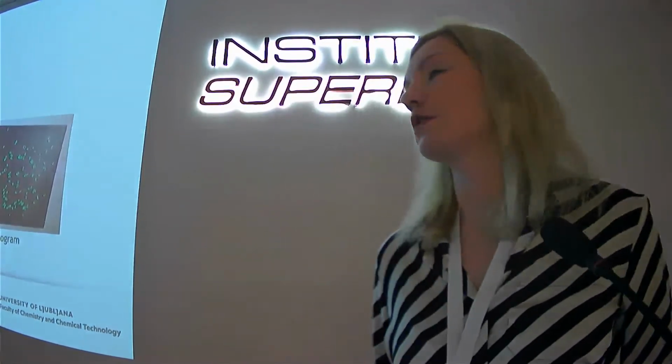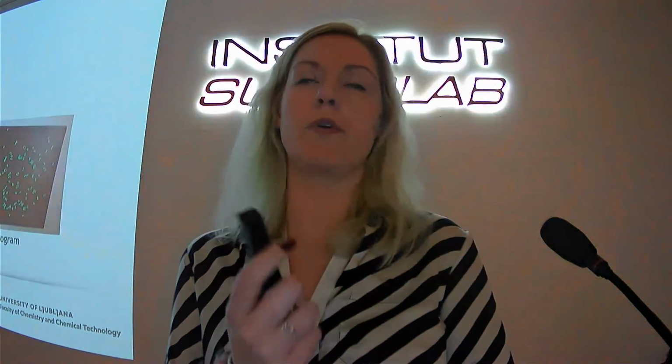In the case of larger particles, so we are mostly talking about mesoplastics or larger, you cannot really use, for example, a laser diffraction analyzer anymore.